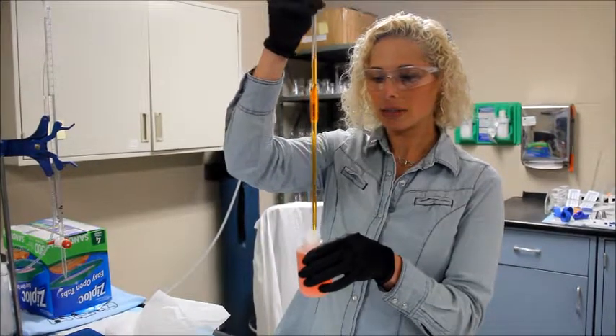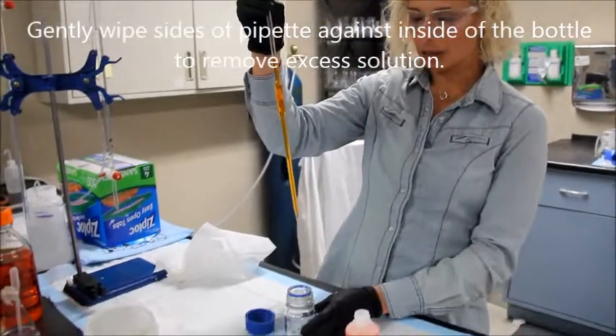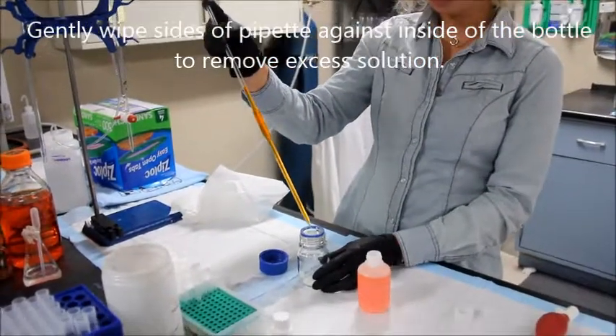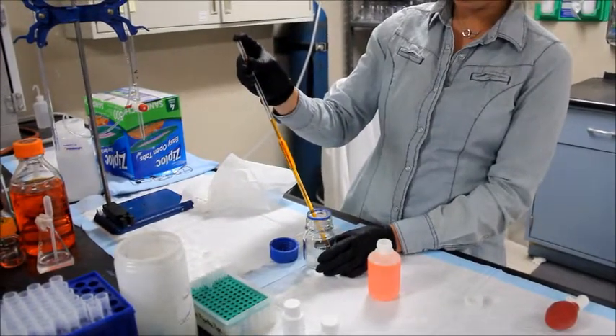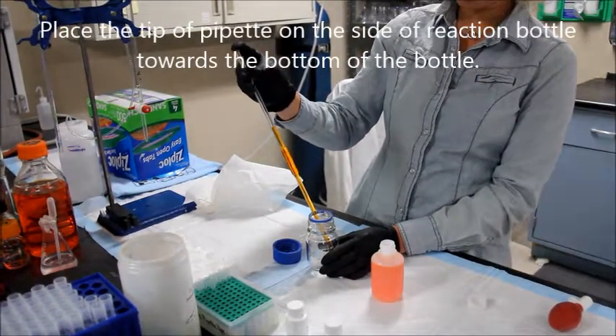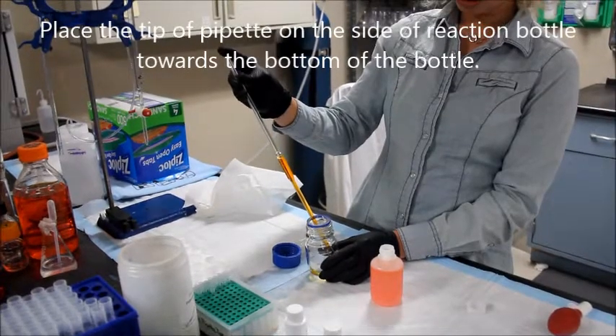Once you're there, gently scrape the sides of the tip on the inside of the bottle, and bring it over to your reaction bottle. Place the tip to the side of the reaction bottle near the bottom and let the liquid drop into the bottle.